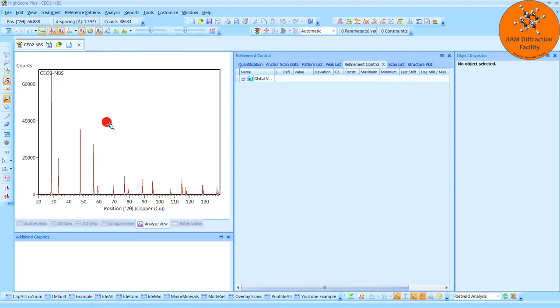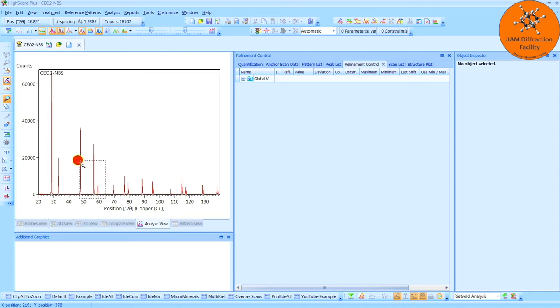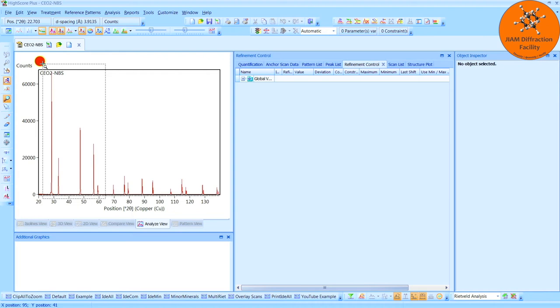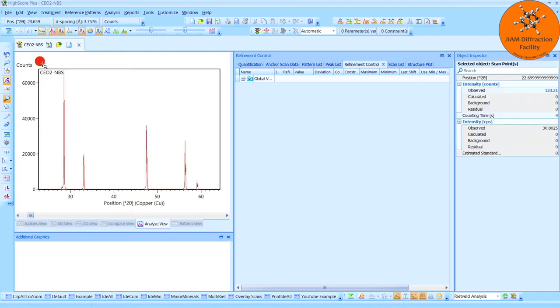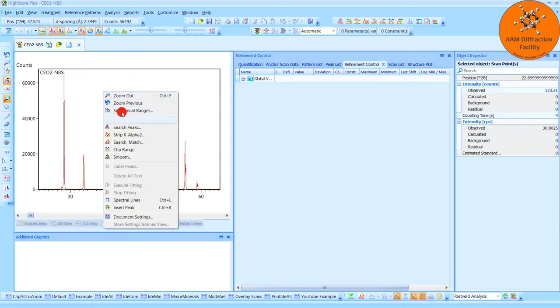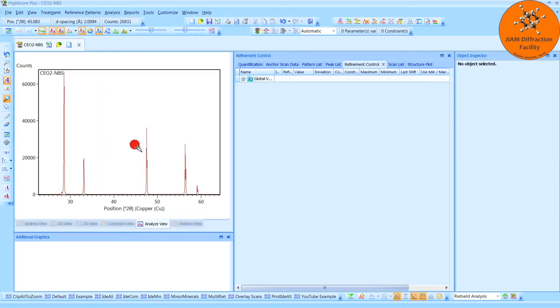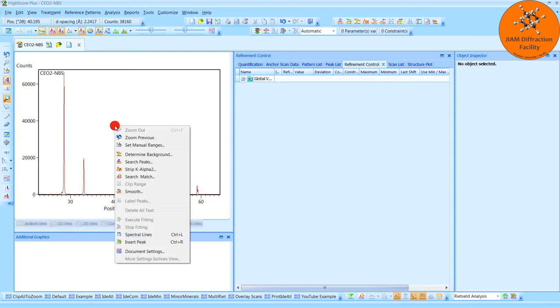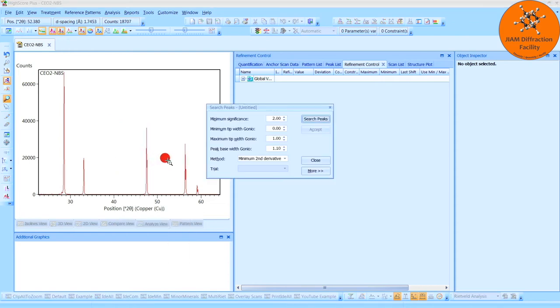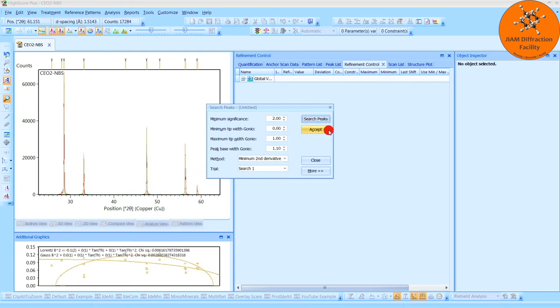So I will left-click and draw a zoom box a little bit bigger than 30 to 50. For this example, I will just do about 25 to 65. And this part is optional, but I like to right-click and then clip the range, and that deletes everything outside of this zoom window. That way, I can just focus in on these peaks. So I will right-click, search peaks. I will use whatever settings are here, and search peaks, and accept.